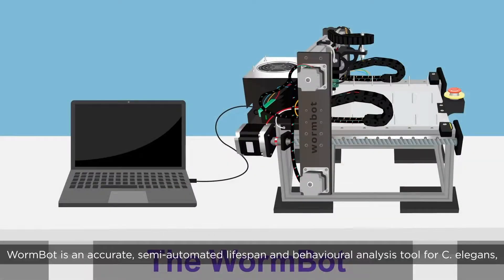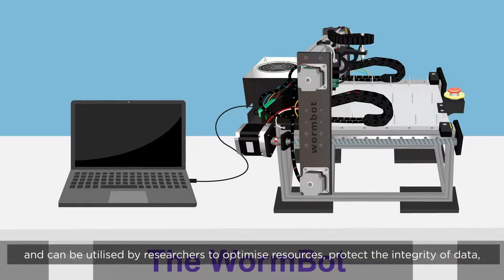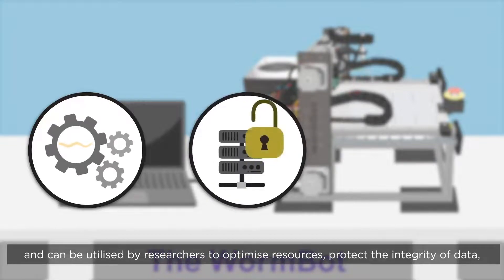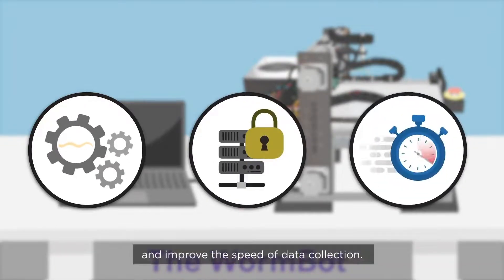WormBot is an accurate, semi-automated lifespan and behavioural analysis tool for C. elegans, and can be utilised by researchers to optimise resources, protect the integrity of data and improve the speed of data collection.